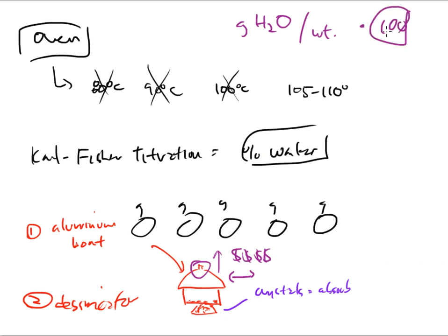All right, so the laboratory directions will give you that calculation. It will spell out that equation that you need to use. As long as you can plug your numbers in the right way, I think that you'll be able to solve that equation without a problem. Okay, so folks, there it is. There's the test. That's loss on drying. The question that I always get is why and how.